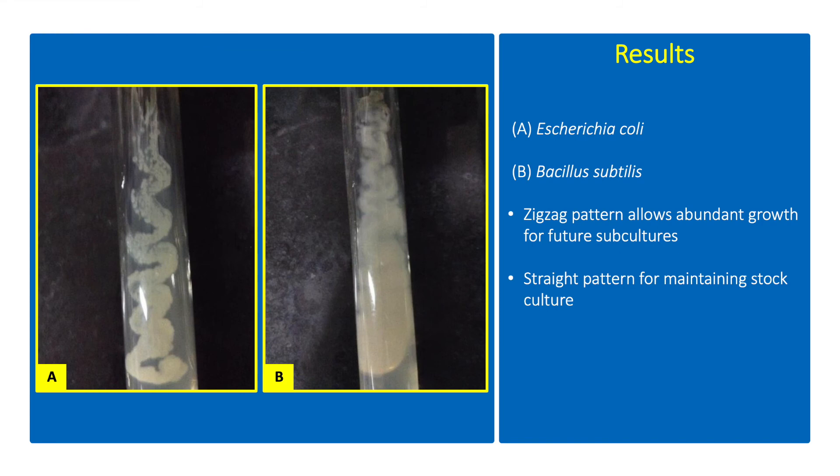These are the results showing the zigzag growth of E. coli and B. subtilis on NA slants. Zigzag pattern allows for abundant growth ideal for subculturing. A straight pattern is ideal for maintaining stock culture.